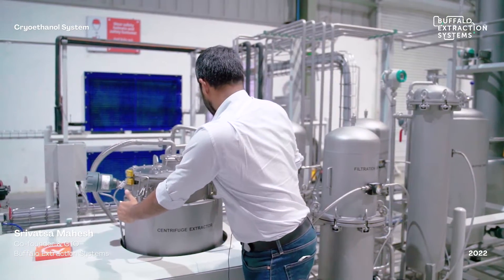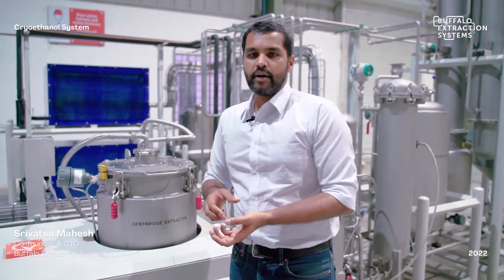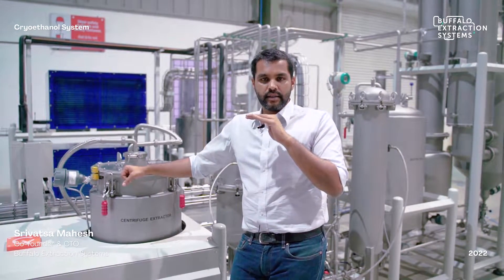Once the centrifuge is closed, operation is completely automatic. Like a washing machine, it runs multiple wash cycles — rotating clockwise or counterclockwise — with a set stabilization or residence time between cycles, then spins at up to 2000 rpm to remove all ethanol from the biomass, ensuring minimal ethanol loss per batch.